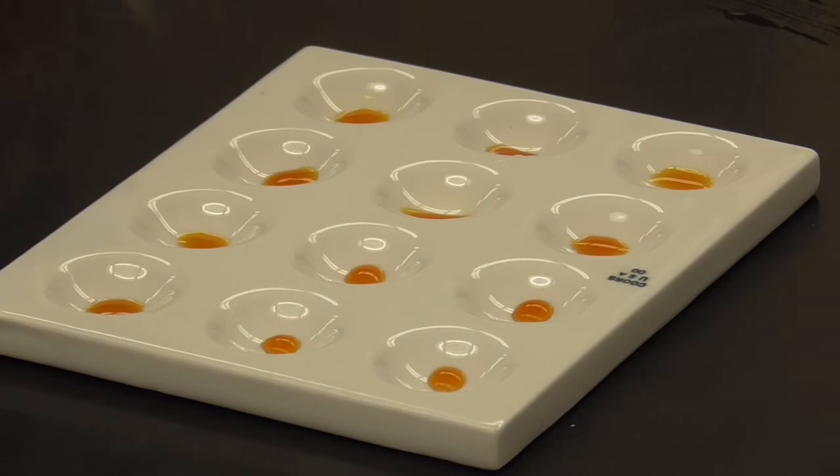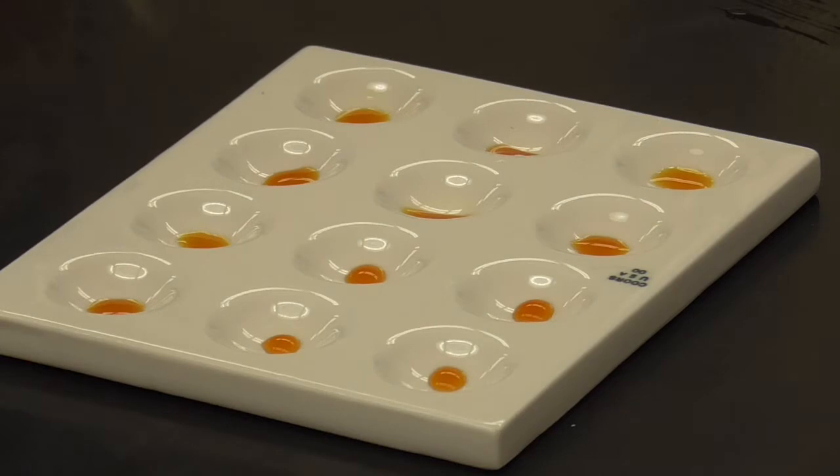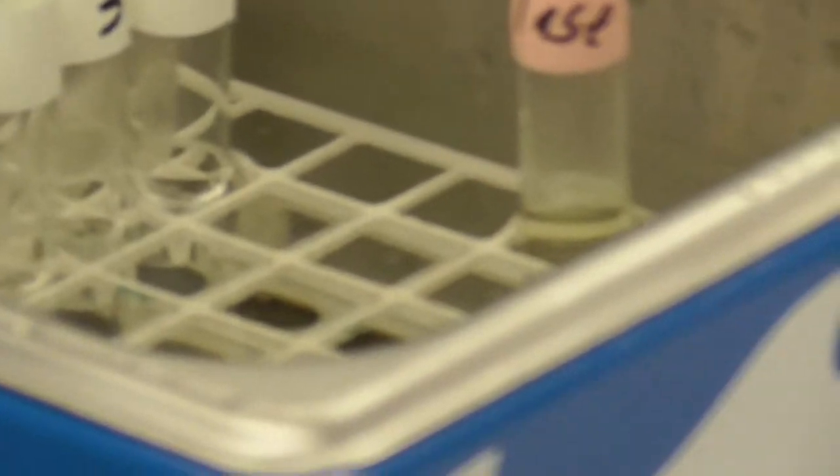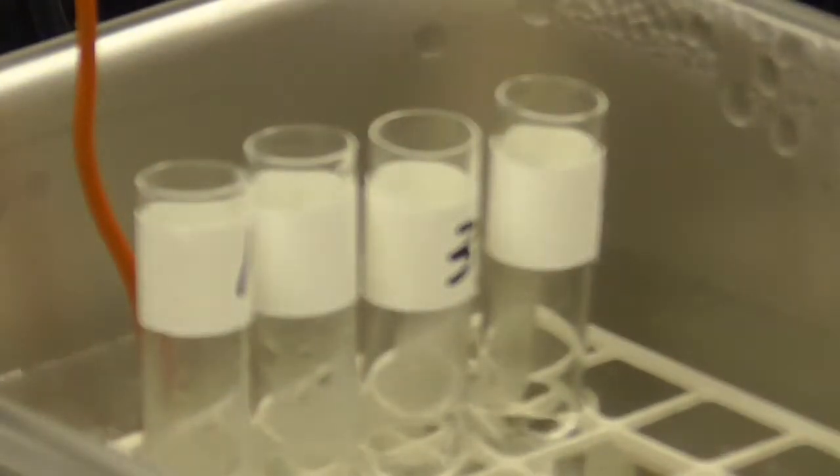And we have our 4 test tubes that are being brought up to 37 degrees. The idea is we're going to put different amounts of our amylase solution in each one of those test tubes, and then we'll check to see what kind of activity we have. So, reading the next one, let's go back over to the water bath here. In test tube number 1, we're not going to put any enzyme at all.